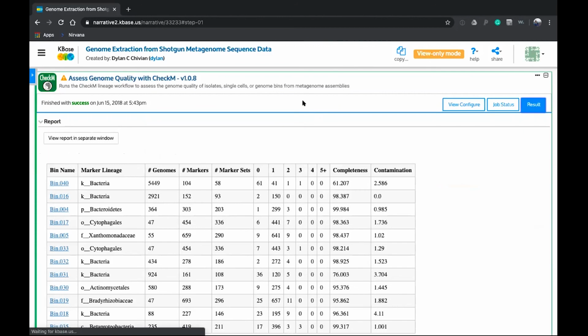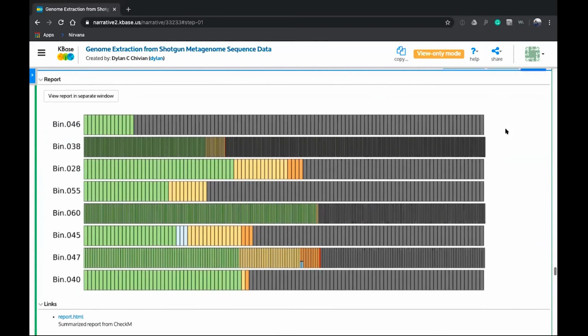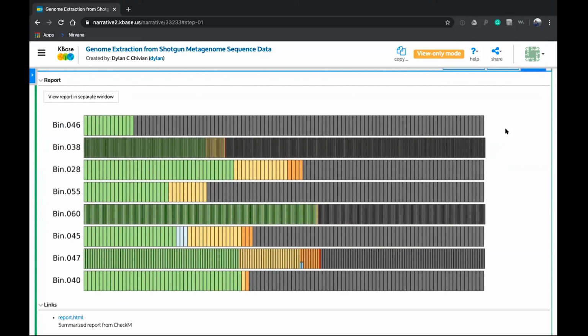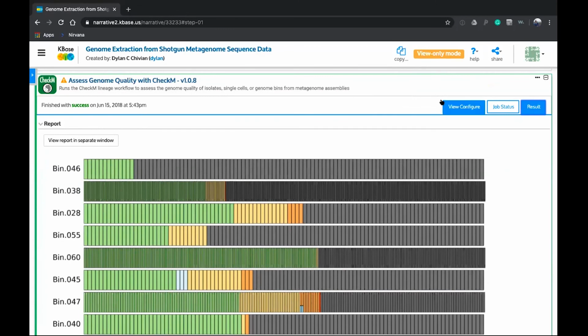So for those of you not familiar with CheckM, CheckM is a powerful tool developed by the folks in Queensland. Phil Hugenholtz and Gene Tyson, Donovan Parks specifically is the lead designer. And it's a great tool that's used to assess the location on the tree that your genome is placed, and provides contextual single copy marker genes to determine if your genome is complete or contaminated. And it works fantastically, and it's very widely cited.